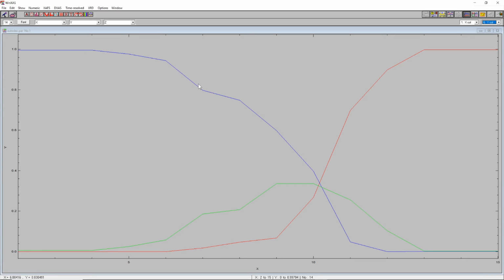So basically this procedure reproduces the concentration that I selected when constructing those spectra for the purpose of showing how this procedure works, and of course also for a proof of principle. So we get the same concentration, the same evolution concentration here that we already observed in the factor analysis. So the procedure works. Again, it's a best case scenario in a sense that you have perfect references for that.